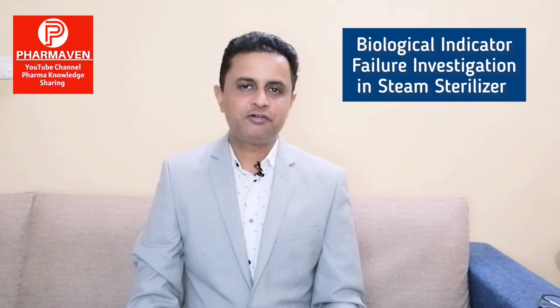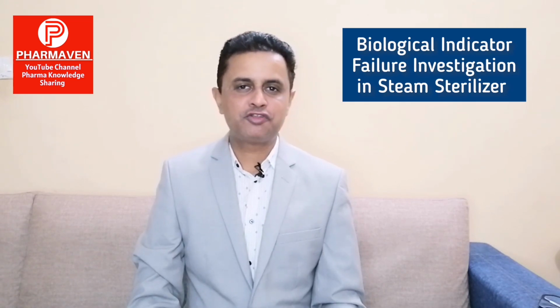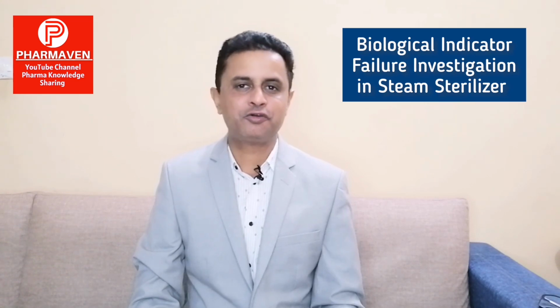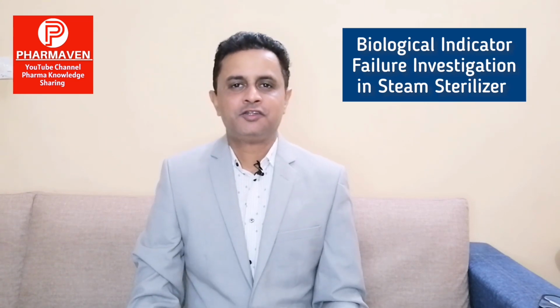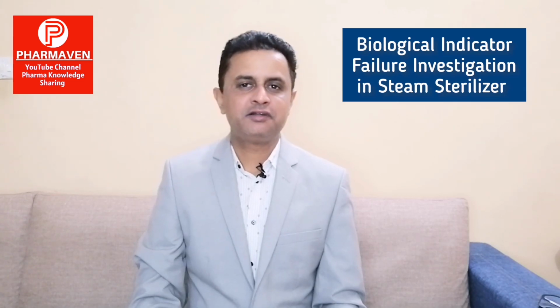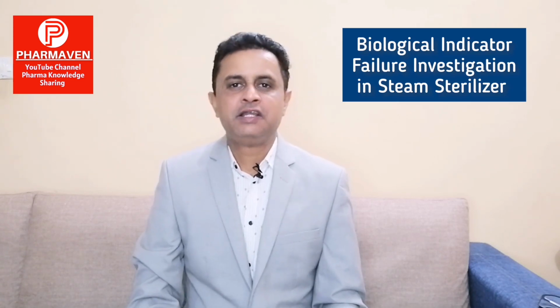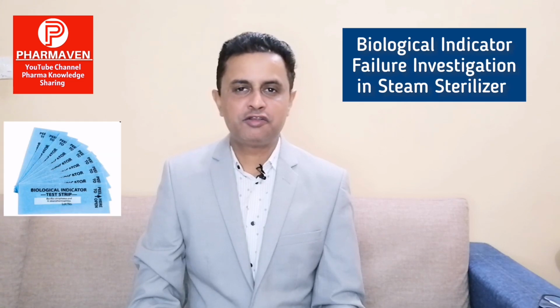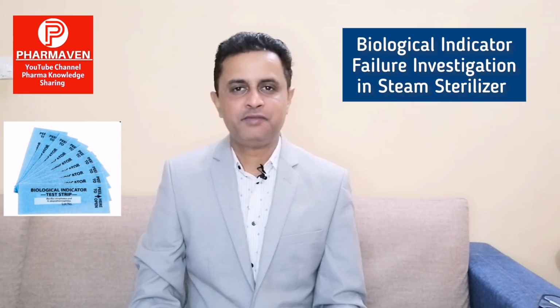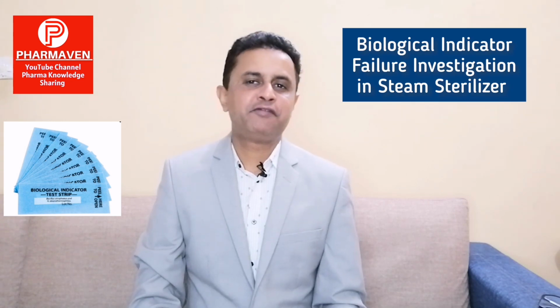In today's video, I will be discussing biological indicator failure in steam sterilizer qualification or autoclave qualification. During initial qualification or maybe during the requalification of an autoclave, we may encounter biological indicator failure, where one or more biological indicators inside your load pattern may fail. So, how can we investigate?